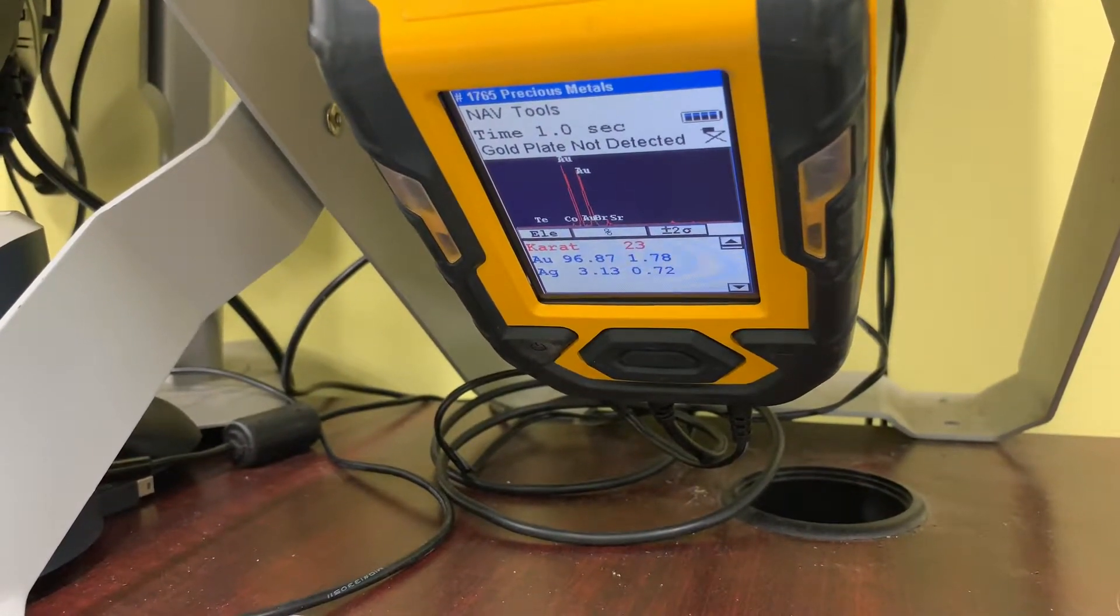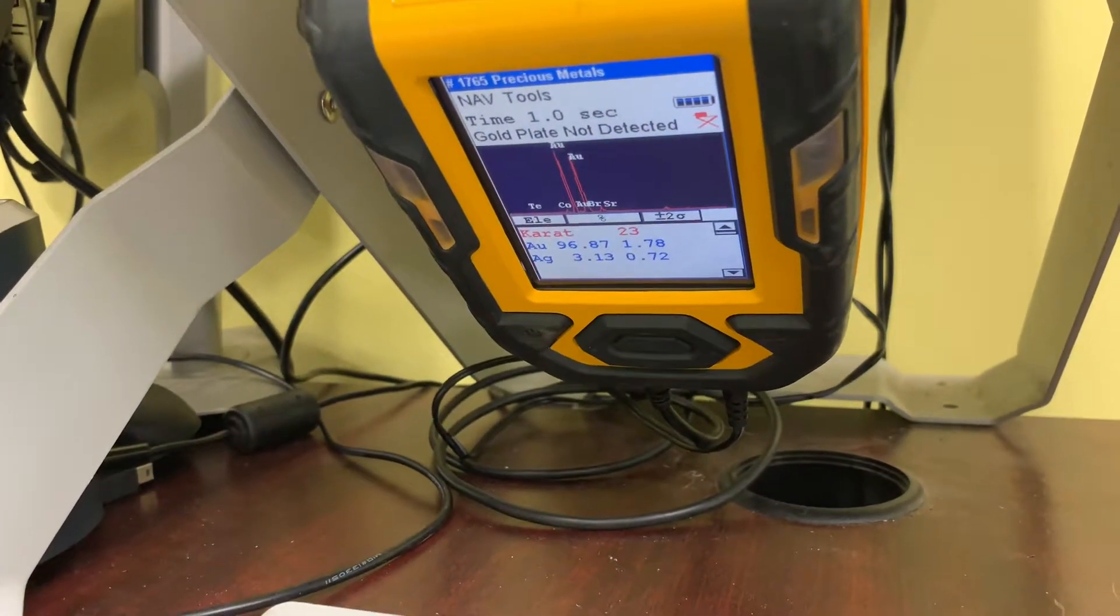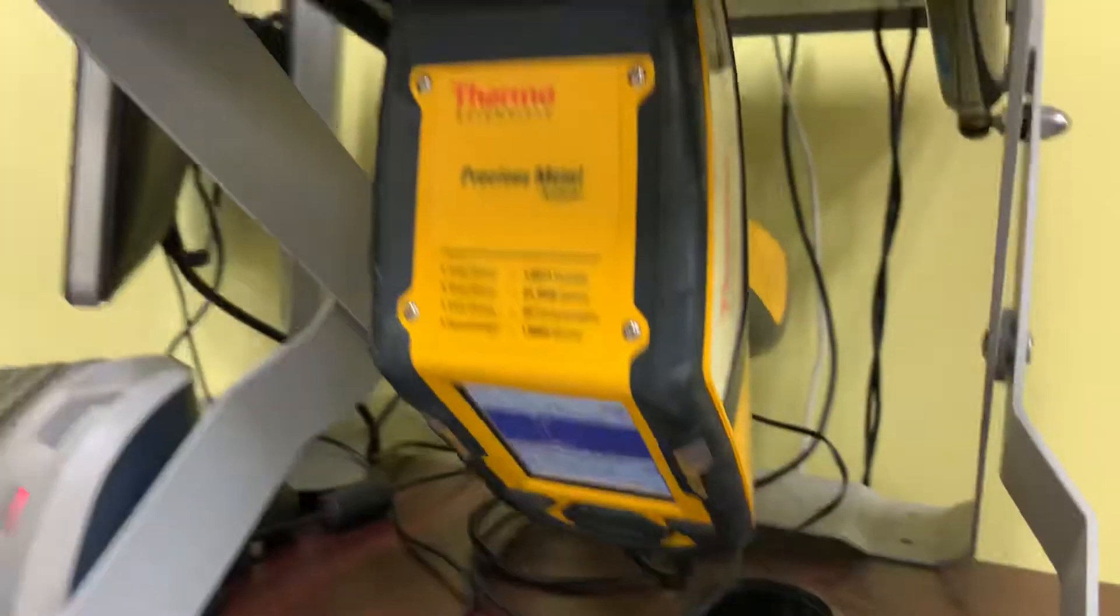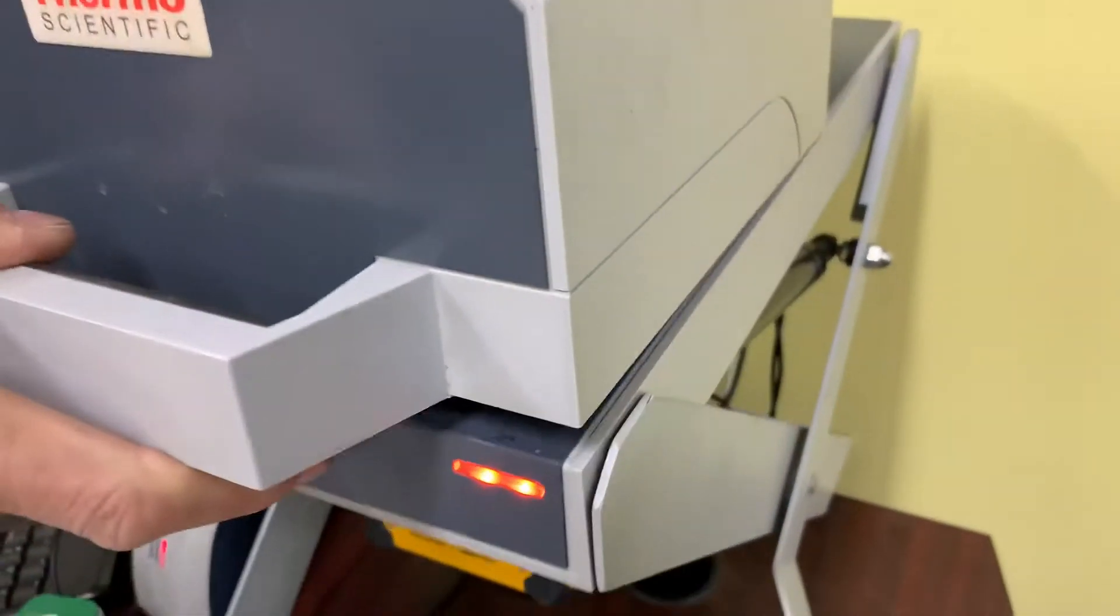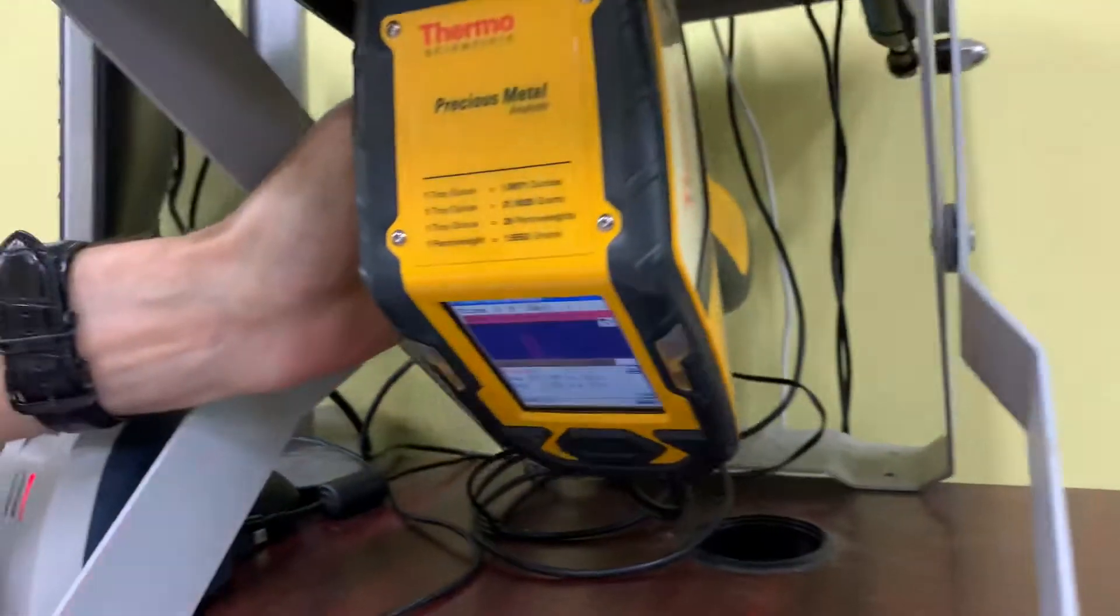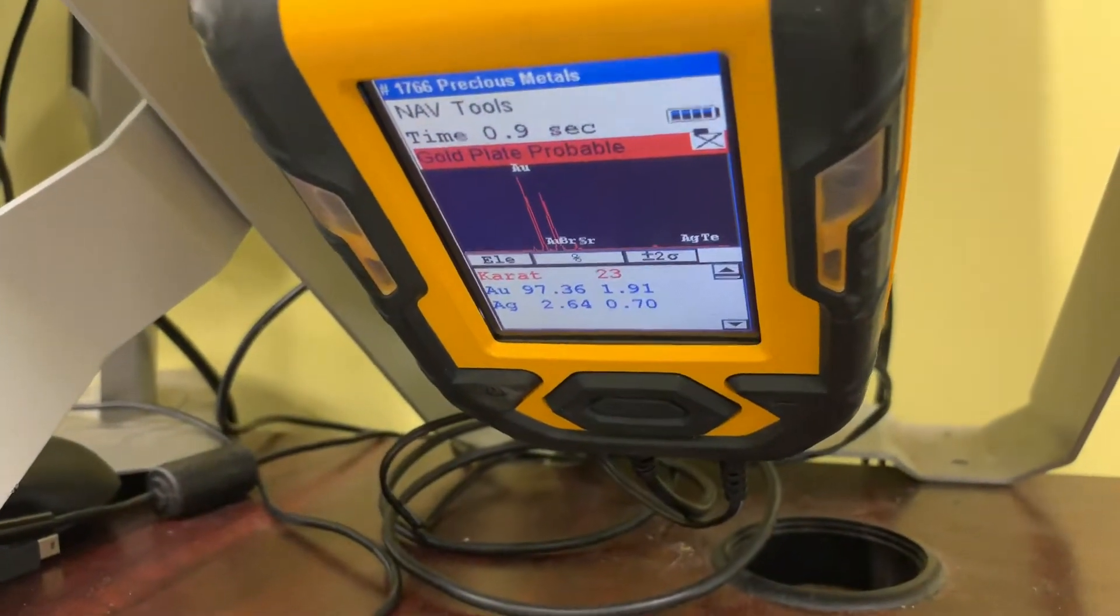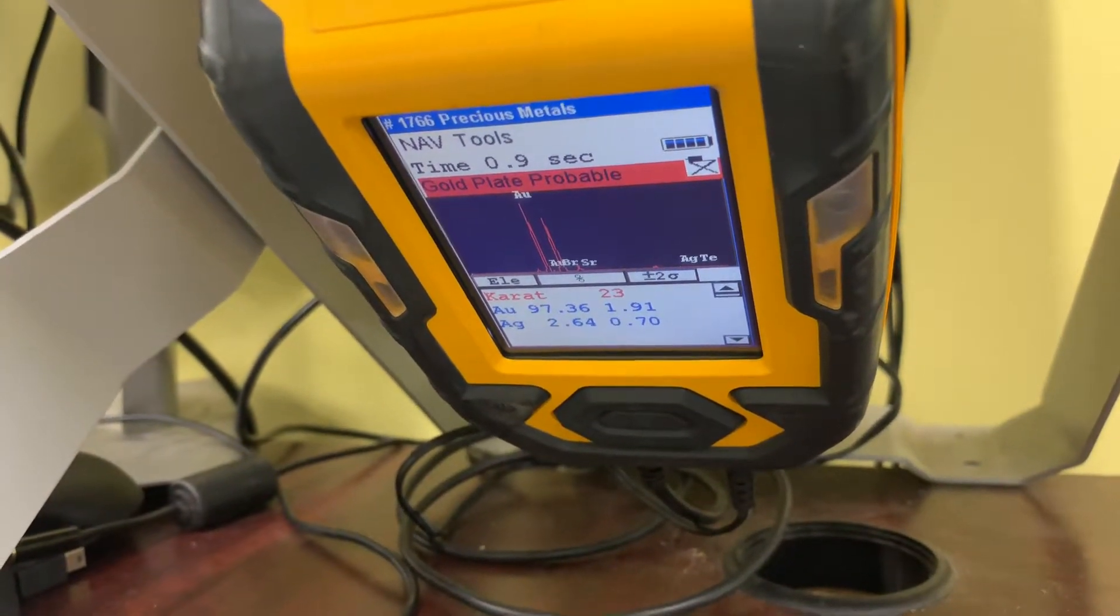Do you want to hit that other side of that? Let's see if it's in. Yeah, let's see if the back side. The back side's a lot different looking, it's a little rougher, but I bet it's going to be similar. A little higher, 27 and a third, 97.36.